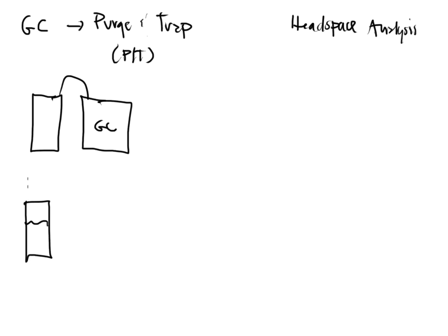What goes on is that I have helium that requires the GC to work. And in the Purge and Trap system, helium also goes into the Purge and Trap system. So what happens is that a sample of liquid is sucked up and it is sent into a P&T tube. That represents a glass tube inside of a bigger attachment piece, okay?